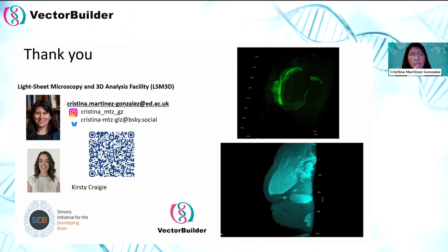And I'm not sure if I mentioned, but with solvent, you image, do the immuno, image. You can rehydrate, re-immunolabel against something else, re-clear and go back to image. So you can do multiplexing. You can use 4 or 5 channels and then go back and multiplex and multiplex. Obviously, by the third round of labeling, you might not get the great signal.